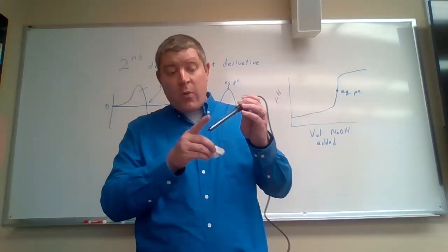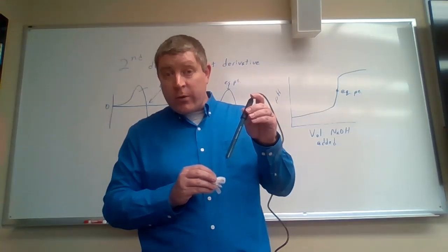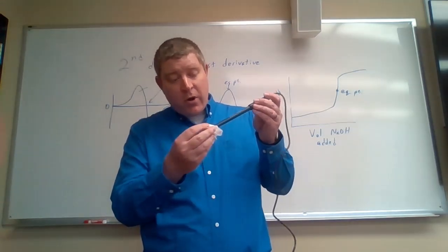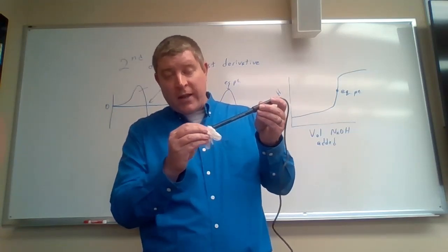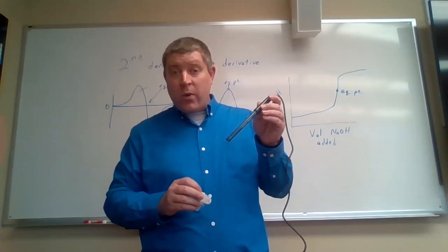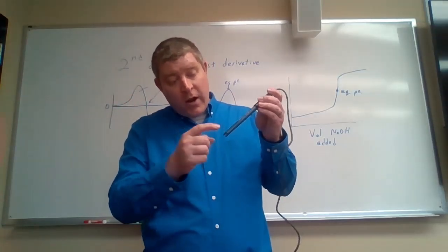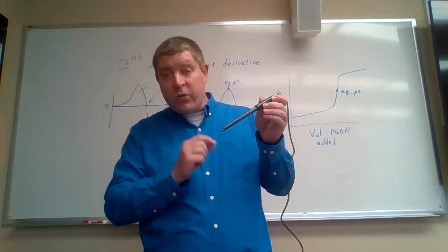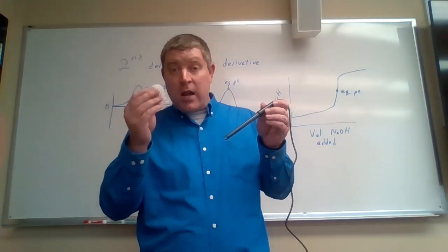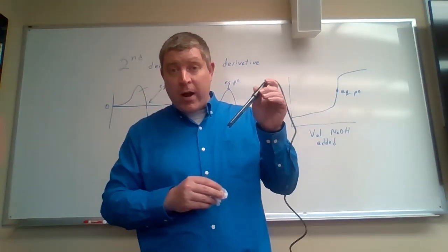Now, if you noticed, when I took the pH probe out of the solution that it was stored in, I took the Kim wipe and I wiped off that glass bulb at the bottom. You want to do that, but you also want to take some distilled water or deionized water in a squirt bottle and squirt the entire bottom of the probe, including that glass bulb, rinse it off really well into a waste beaker, and then take a new Kim wipe and blot the sensor dry.